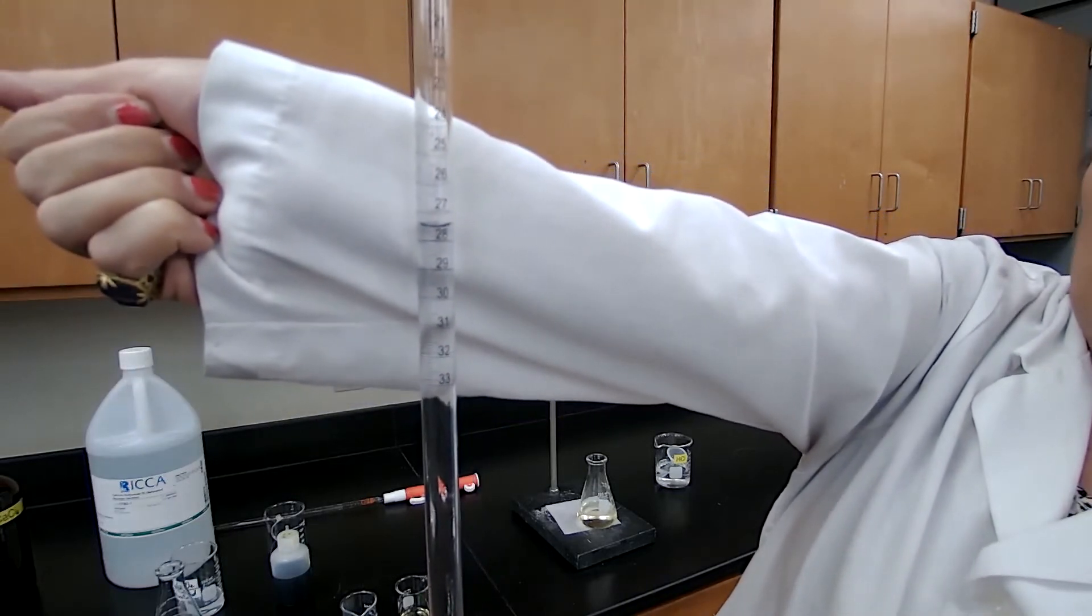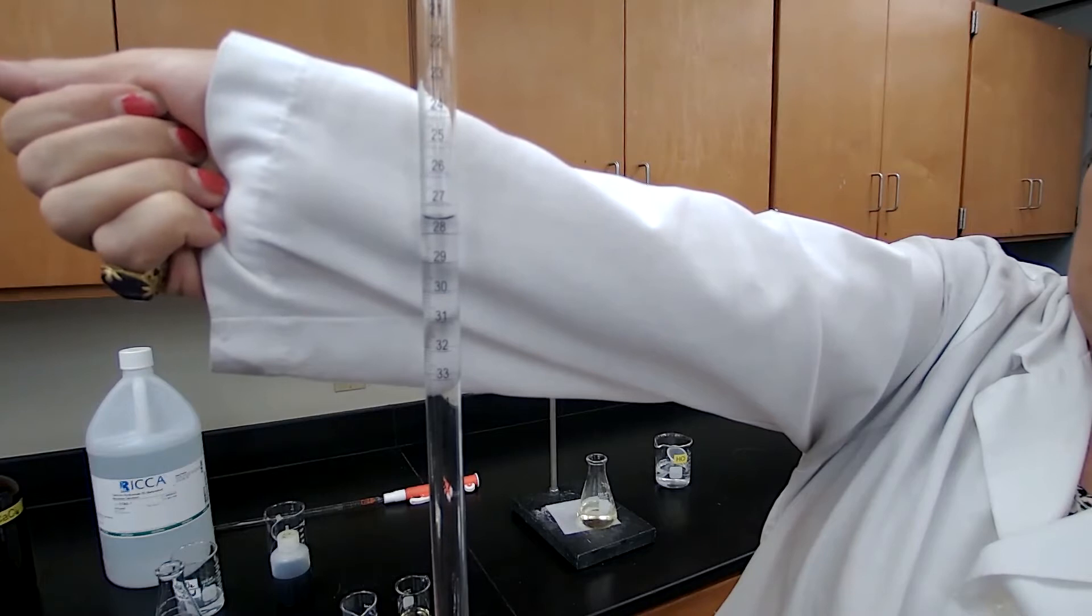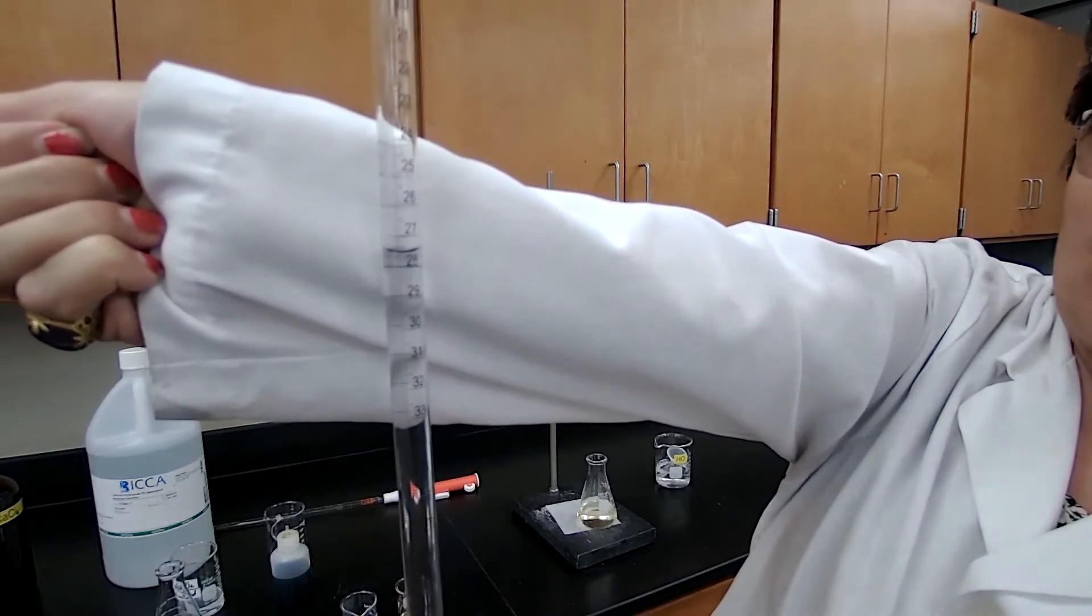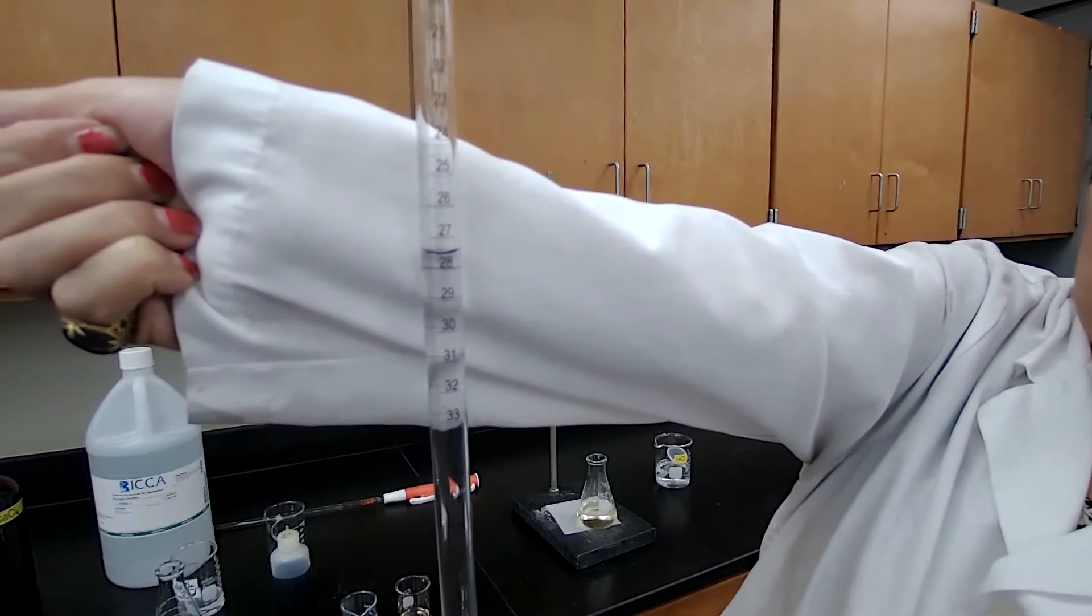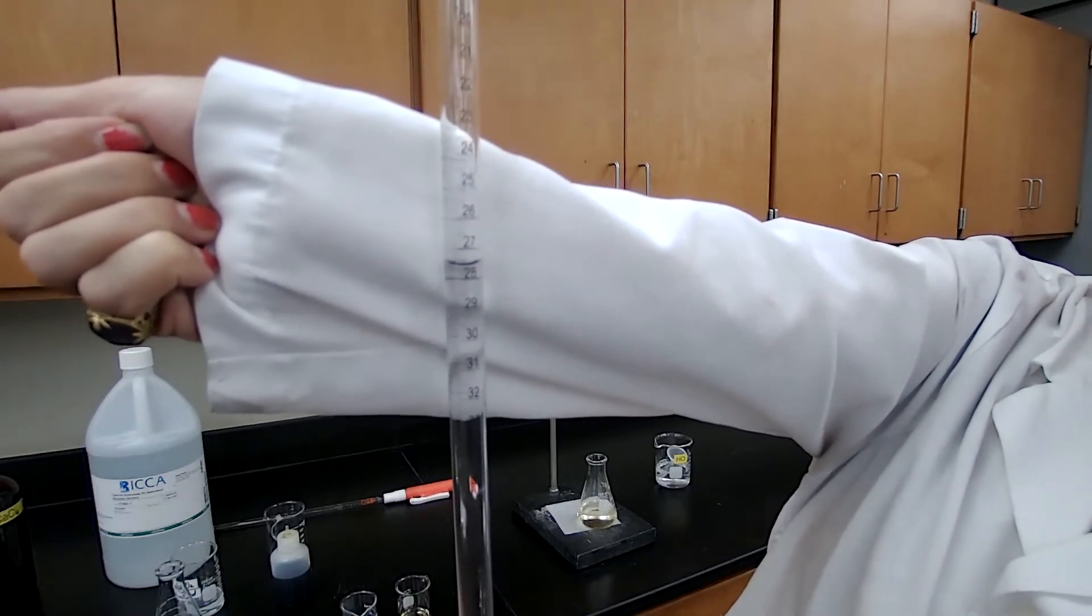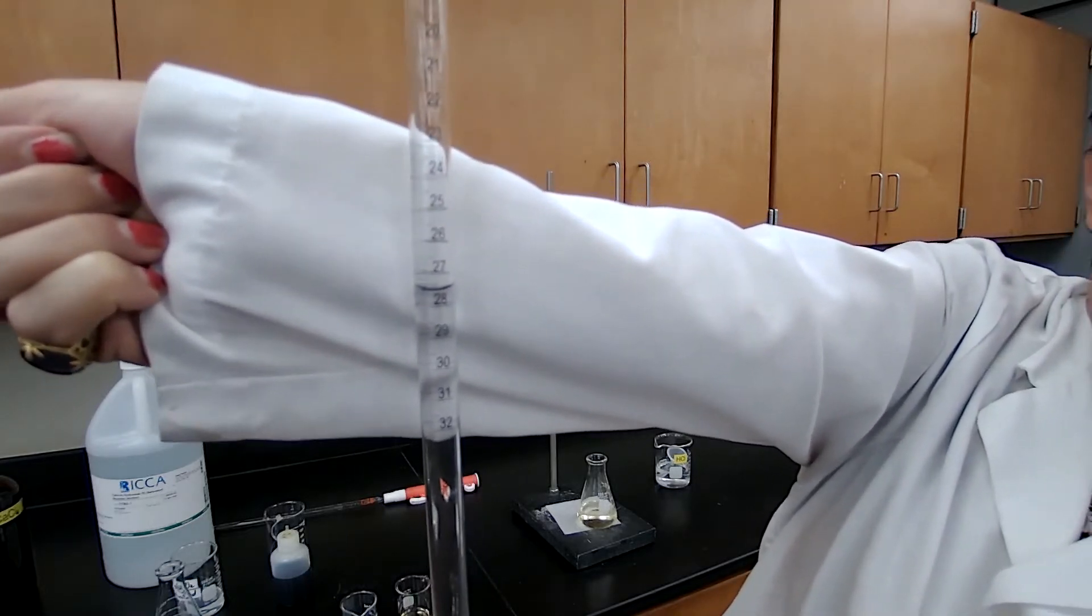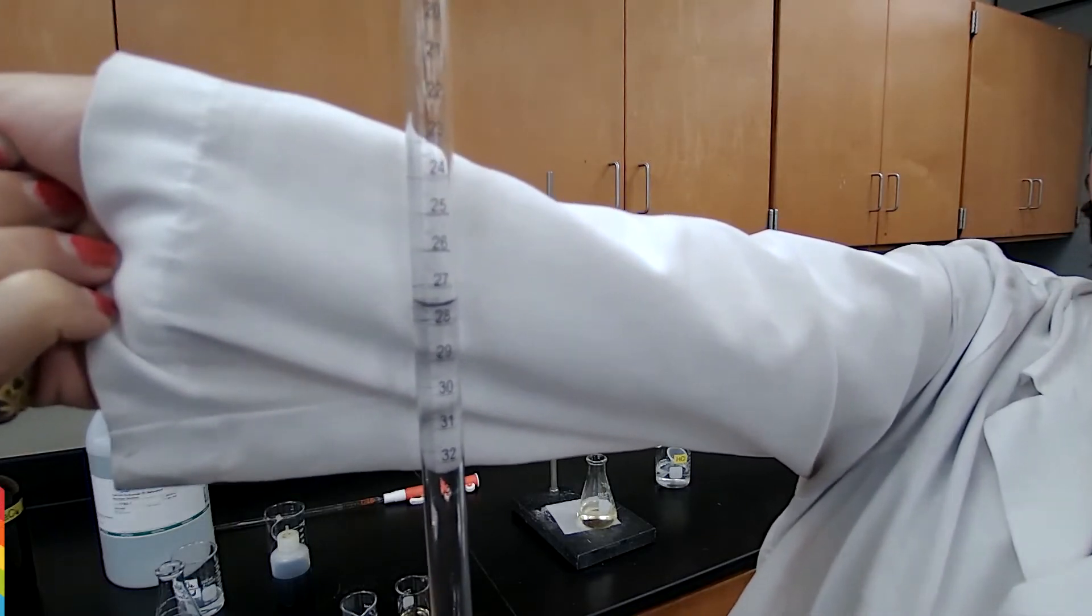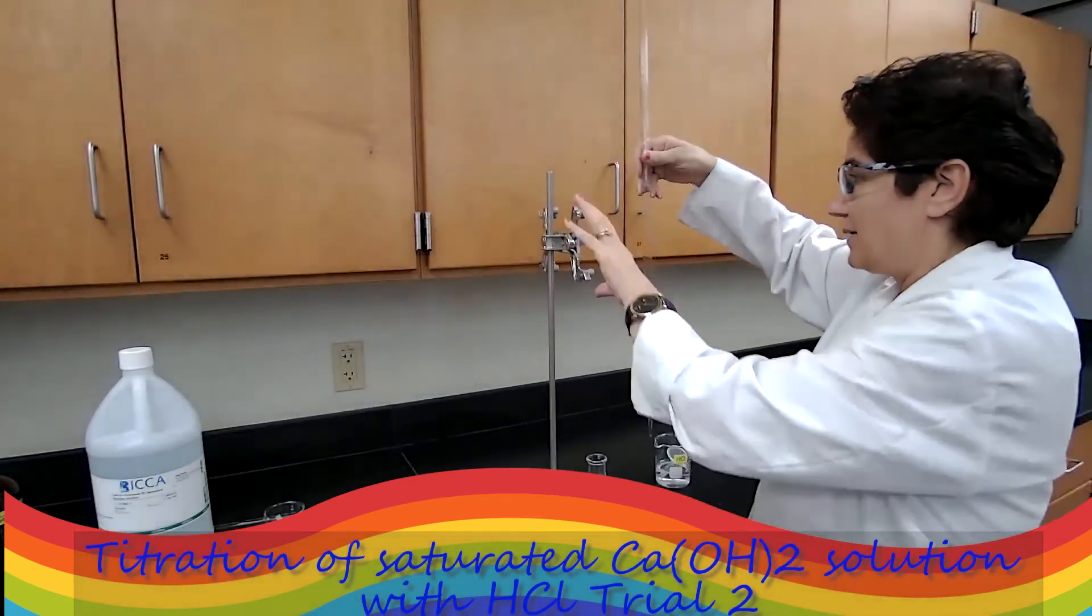And this is for the first trial of the titration for calcium hydroxide, saturated calcium hydroxide. Record your number. The initial burette reading was zero point zero zero zero. And this is the final burette reading.